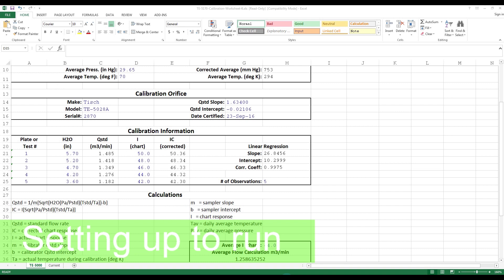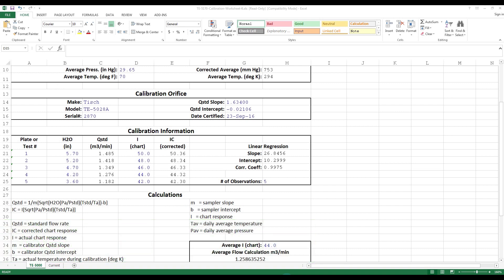The next step is to figure out where we want to run the TSP air sampler. Let's say we want to run it at 45 CFM. We need to look at the Q standard numbers on the worksheet and find one that's close to 45 CFM. 1.276 cubic meters per minute equals 45 CFM. Looking at that number, we would go over and look at the chart number, which is 44. So to run this at 45 CFM, we would need to set it at 44 on the chart.